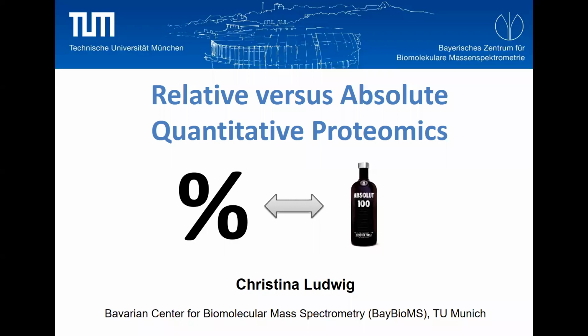Try to give a short educational teaser at the beginning, where we try to cover some of the methods that I used later in the presentations. Exactly. And today I would like to cover just one specific aspect that is not only important for the two applications that we will hear later on, but that's generally, I think, a very important point to know when it comes to quantitative proteomics, and that's the difference between relative and absolute quantitative proteomics.